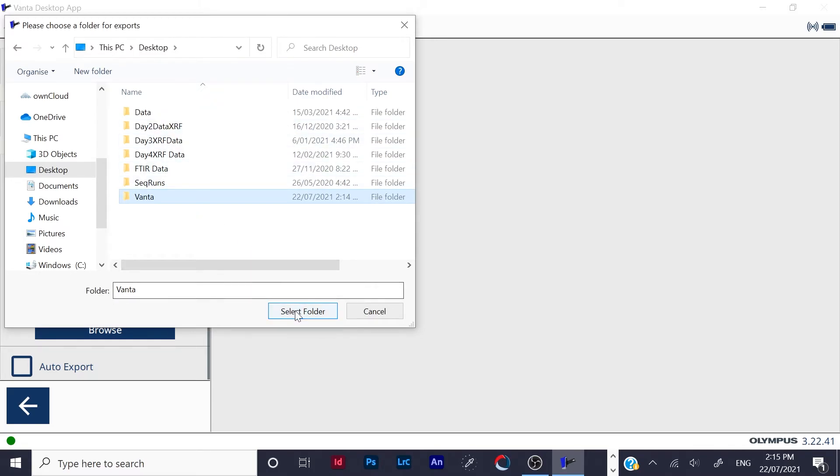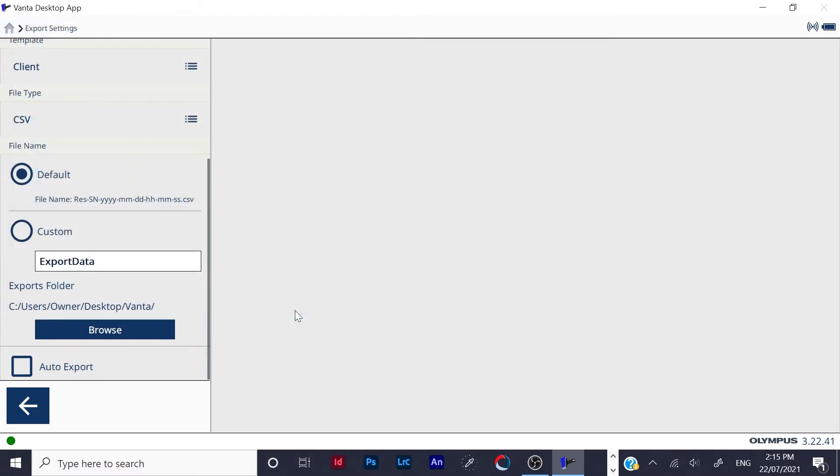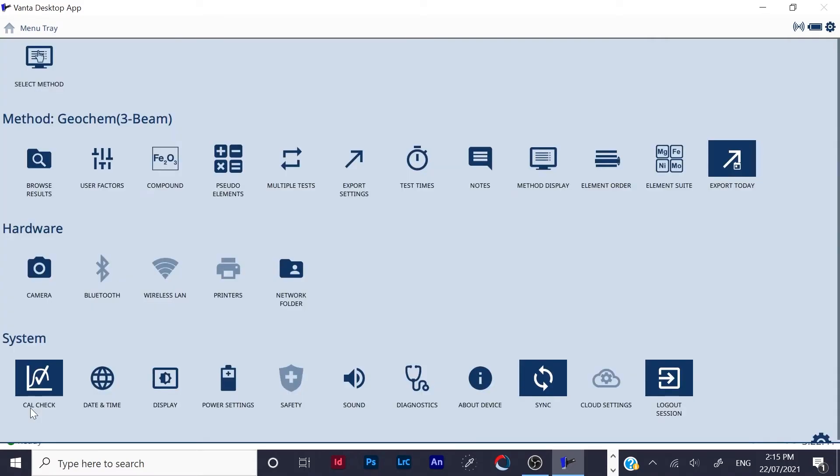And you go select folder. So now all your data that gets exported will be saved on your desktop in that folder you just made. So now click the back button.